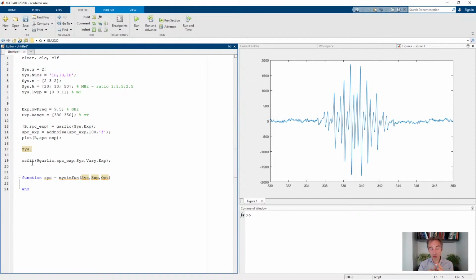And what I like to typically do when I do this, I preface my own parameters with my. So in this case, I want to have myA in there, and it's going to be the first A. So we might want to start it out at 20, and we're going to vary that, myA, by ±5. And these are, as always, megahertz.